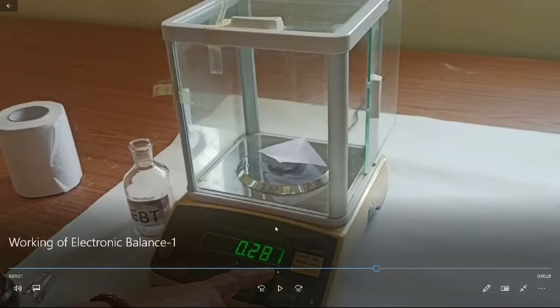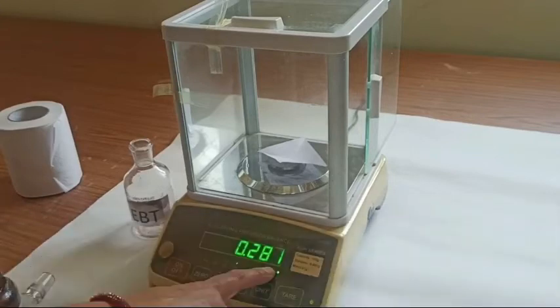And the weight of this paper is 0.281. If in this form we add our sample then that is to be added. So we need to mention this first in our notebook and then whatever be the weight after putting the sample over this white paper, we need to subtract that paper weight. So only then we will get the weight of the sample.